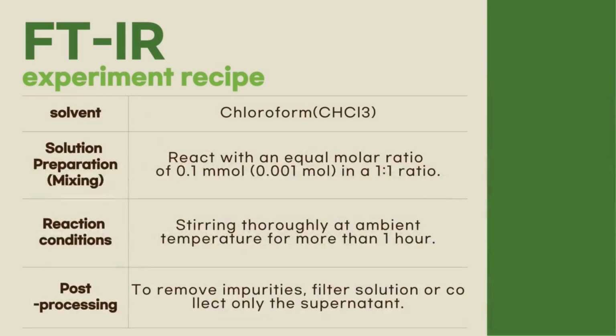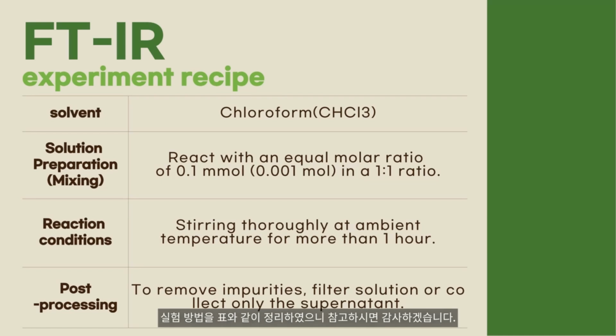The following is a table summarizing the experimental details. Now, we will watch the experiment video.